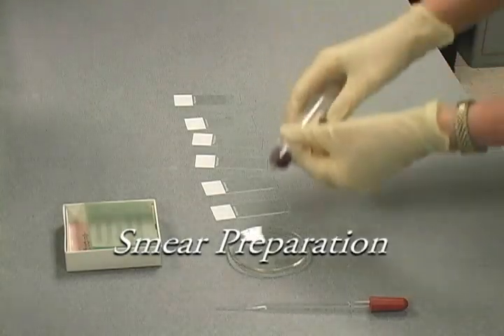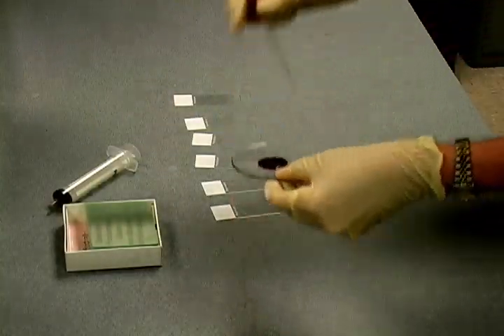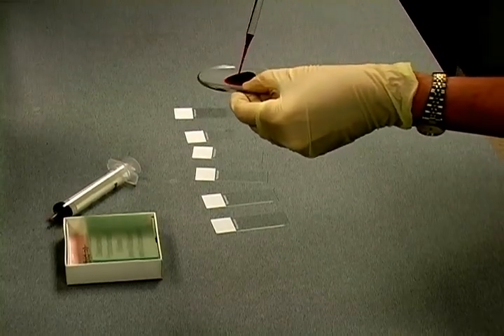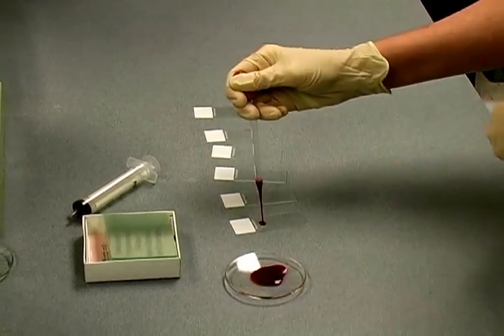Upon collection, the marrow aspirate is immediately expelled into a watch glass. Working quickly before the specimen clots, the marrow is dropped onto several glass slides using a Pasteur pipette. The technician preferentially aspirates visible particles from the edge of the marrow specimen in the watch glass.